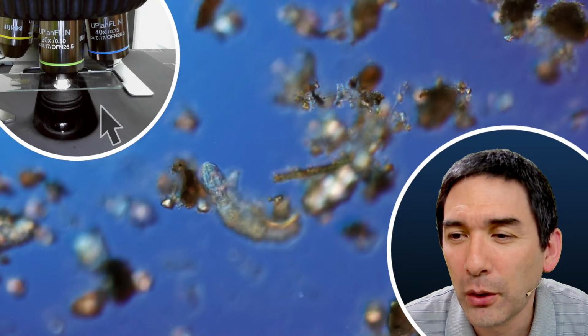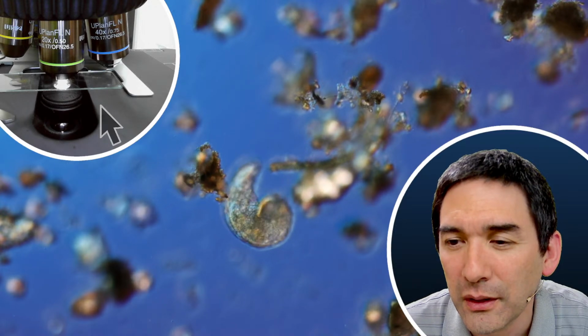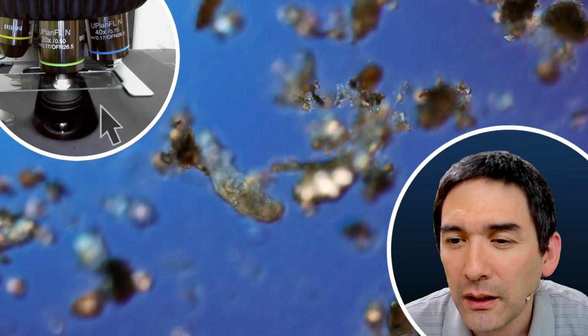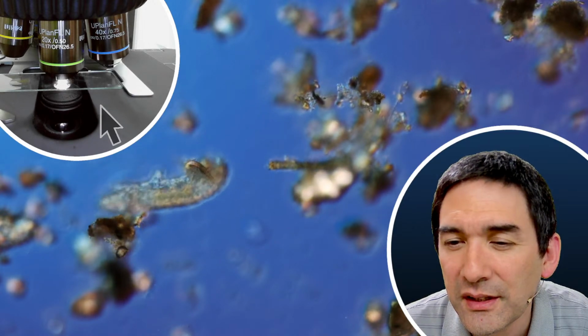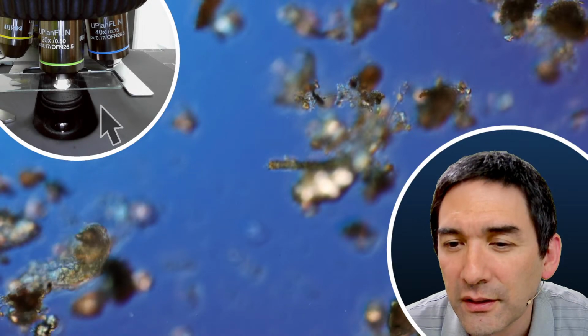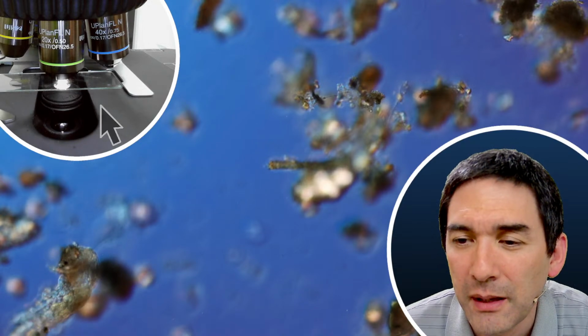The specific part of the scope is removed and put under the stereoscope. All dust can be viewed. Just addressed your recommendation. I hesitated to use it since it is more polishing on the surface. Yep, I think it refers to the use of lens paper.